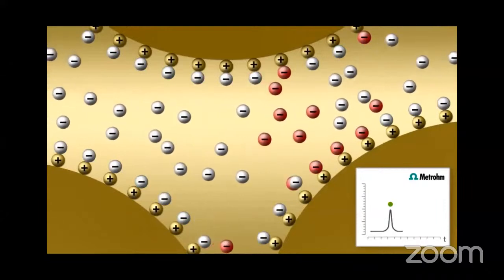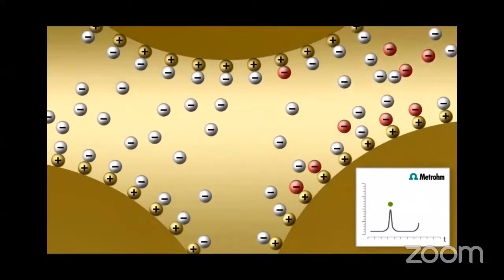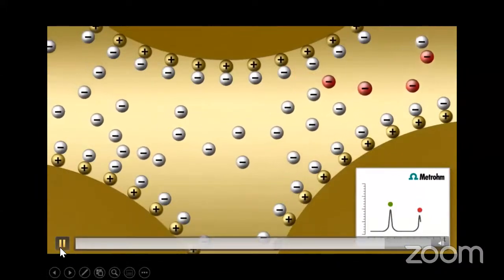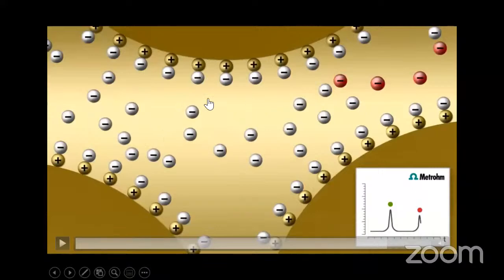On the x-axis, we have the retention time. Now the nitrate ions are eluted out, so again there is a rise in the baseline. That is how the separation takes place. Initially, when we flush the column, the sites are occupied by our eluent ions. Then we introduce the sample. They displace these eluent ions and occupy their space. Then again, these eluent ions replace these sample ions, and they come out through the detector and are detected in the conductivity detector. So this is how it works.